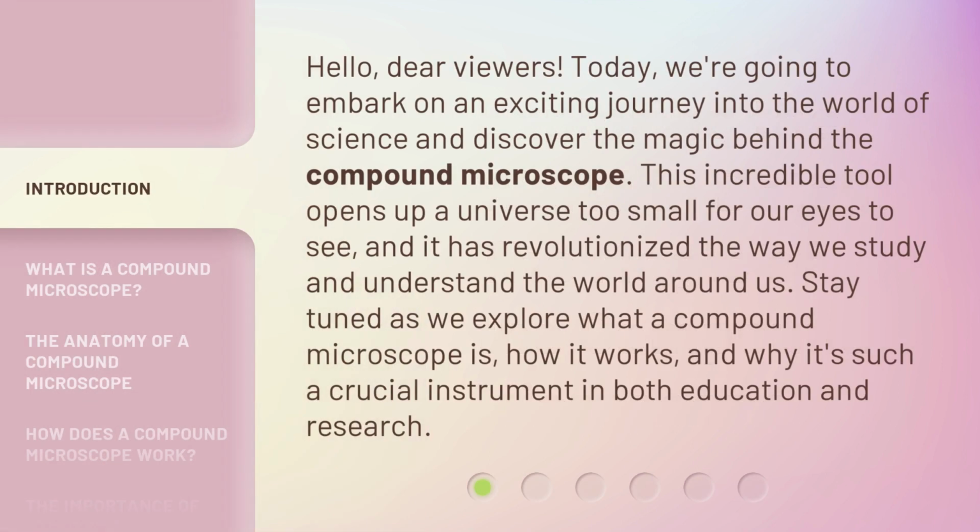Hello, dear viewers. Today, we're going to embark on an exciting journey into the world of science and discover the magic behind the compound microscope. This incredible tool opens up a universe too small for our eyes to see, and it has revolutionized the way we study and understand the world around us. Stay tuned as we explore what a compound microscope is, how it works, and why it's such a crucial instrument in both education and research.